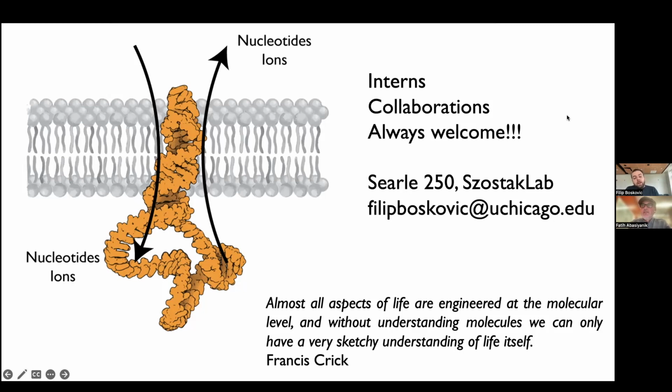So for the multiplexing, I can tell you for RNA, if you want to do direct RNA sequencing, multiplexing is not available as a part of the device, but you can do it manually if you know how to do it. For the DNA multiplexing, let's say 16S, let's say you're doing this metagenomic study, right? So you have a lot of random 16S sequences and you want just to multiplex. There are 2 ways to multiplex. You can multiplex different samples or you can even multiplex different molecules, okay?